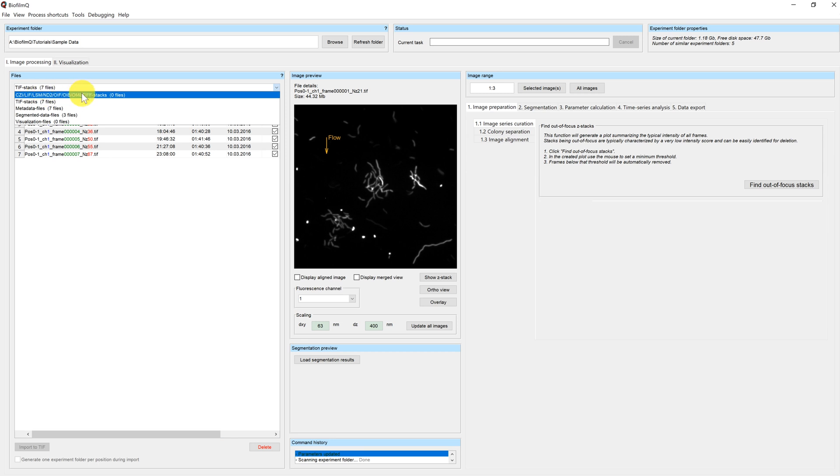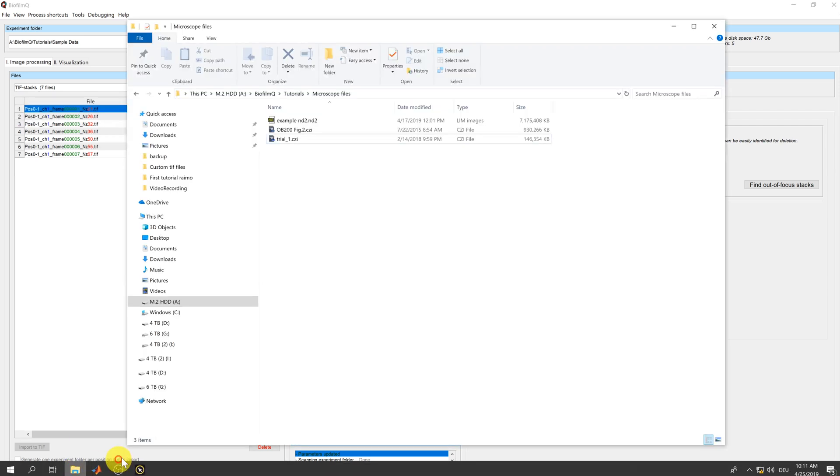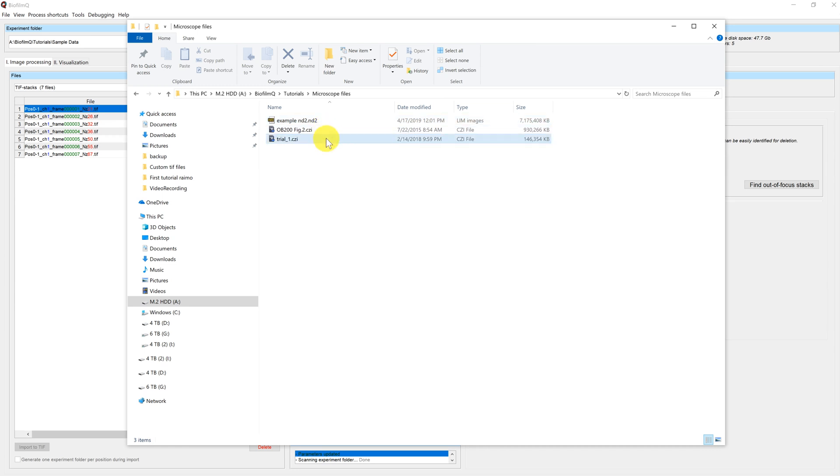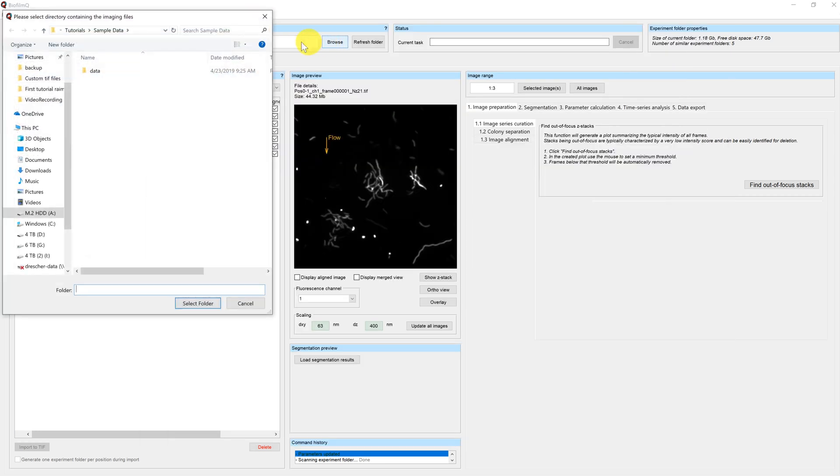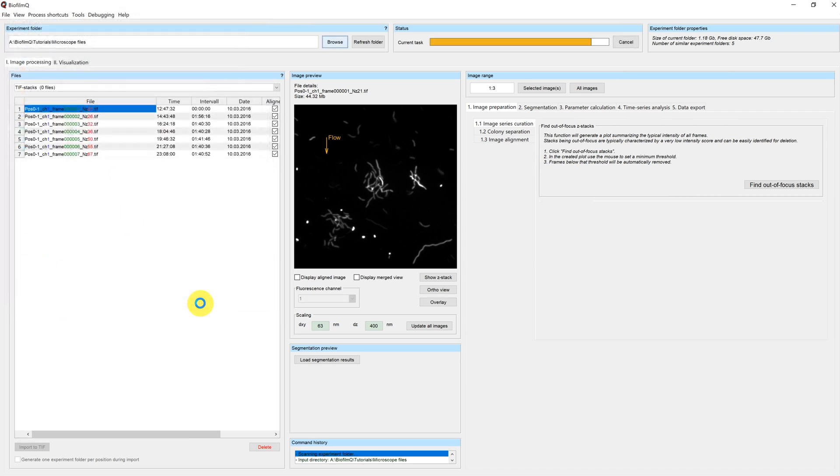In order to show you how to import this data, I have prepared a directory in which, as you can see, we have three files: one ND2 file and two CZI files. So I will now load this directory in BiofilmQ. I will click on browse, select the directory, and load.